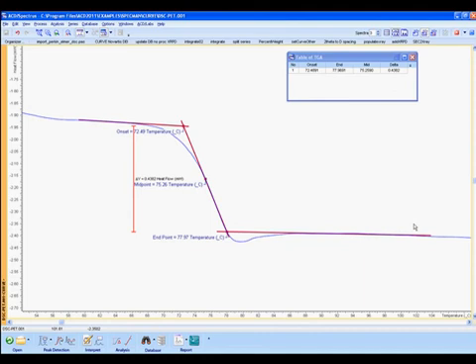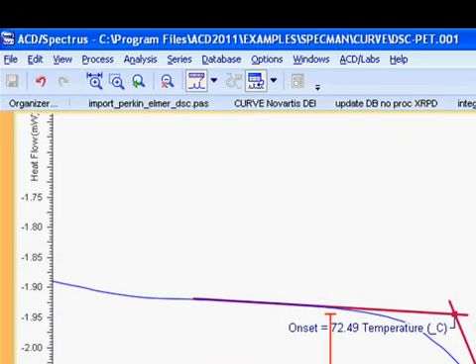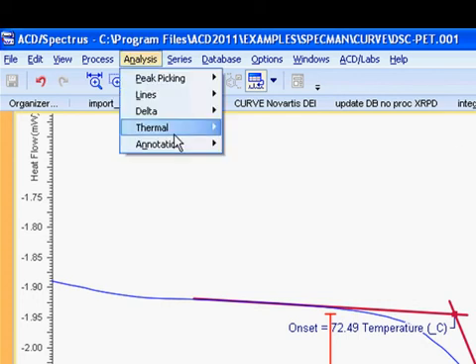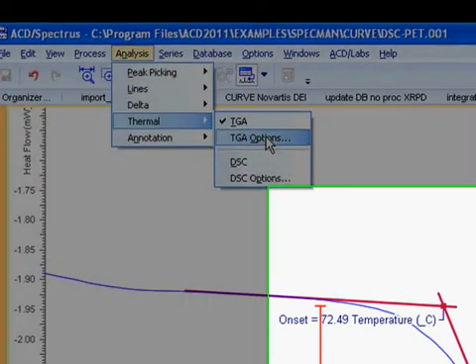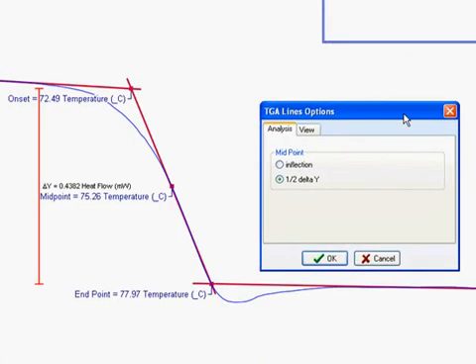The software will provide the onset, endpoint, midpoint, and delta values. If we take a quick look at our options, we see that we are currently using half delta as our midpoint. We can also use the inflection point.